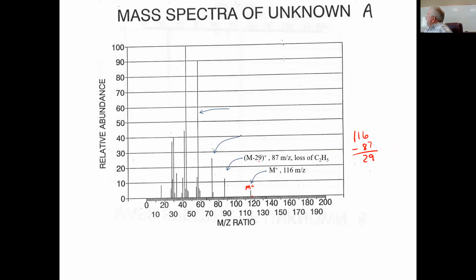Now, what doesn't happen is one molecule losing an ethyl group and then right after that losing another piece. All that energy goes into the molecule, and to break a bond, it has to be in kind of one place. And when it breaks, it's used up. Okay. So each of these fragmentations are different molecules, a different set of molecules. Some molecules do lose an ethyl group. Others can lose something else.